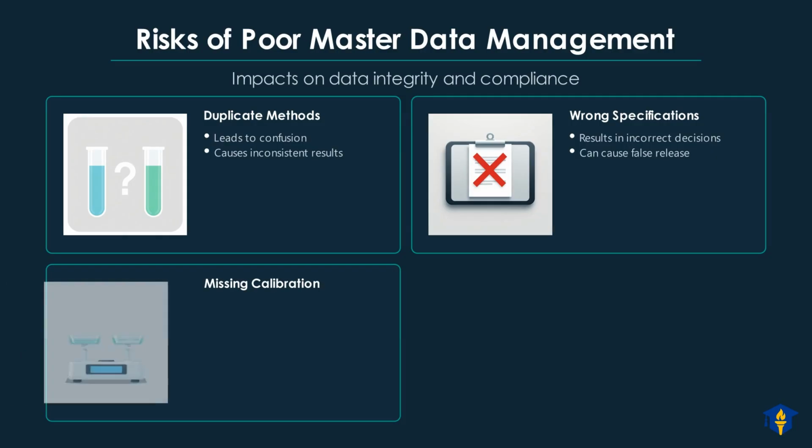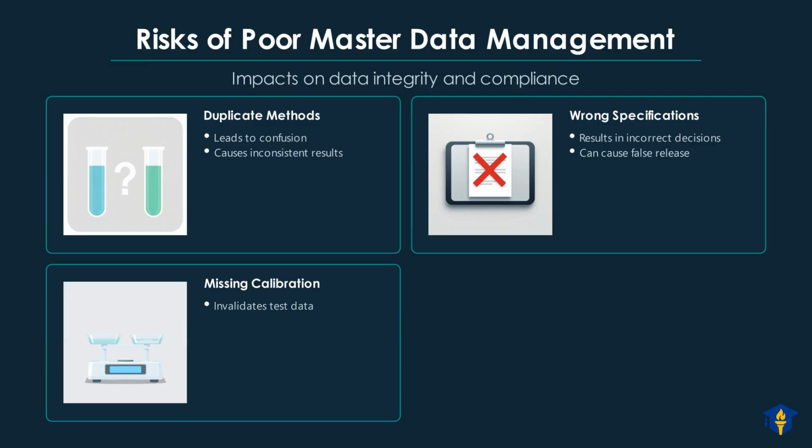Furthermore, missing instrument calibration information poses a serious risk to data reliability. Lack of proper calibration records essentially invalidates any test data produced by that instrument. Ultimately, this directly compromises the accuracy and trustworthiness of all the analytical results.